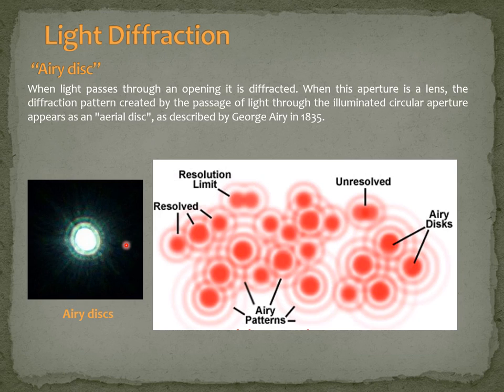And to the observer, this diffraction pattern is seen in here as small light circles. Of course, as I told you before, different wavelengths, so blue and green, will diffract differently. So as you can see, not only do we see circles of light, but you also see some chromatic aberration in these circles. And the first person to describe the reason for these circles of light was George Airy in the year 1835, and the presence of these circles of light limits enormously the resolving power of a microscope, because the circles of light will superimpose.